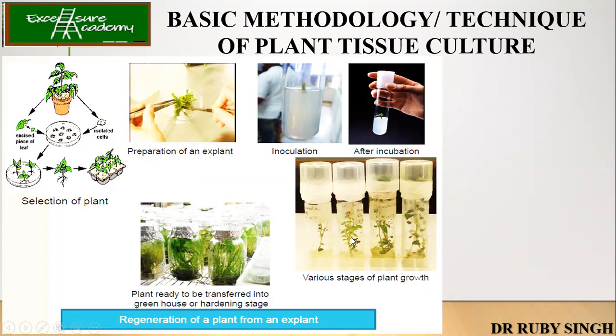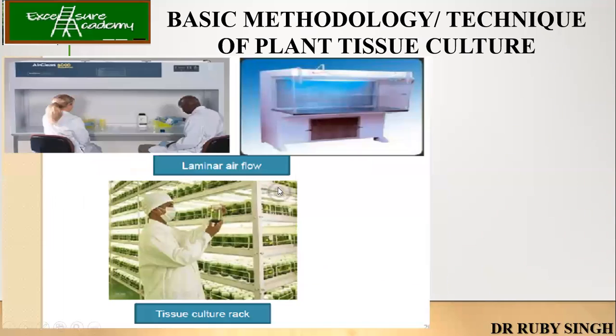Then after addition of more media, if you provide, it can grow into small plants. And then that can be transferred into a bigger container, or you can transfer it to a pot having the soil, or into the field directly, you can do that.